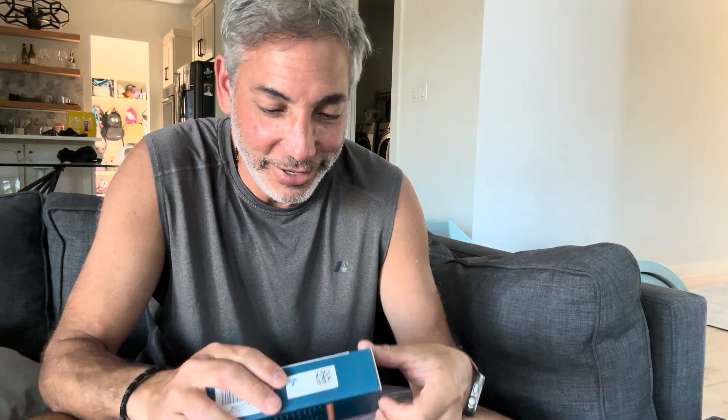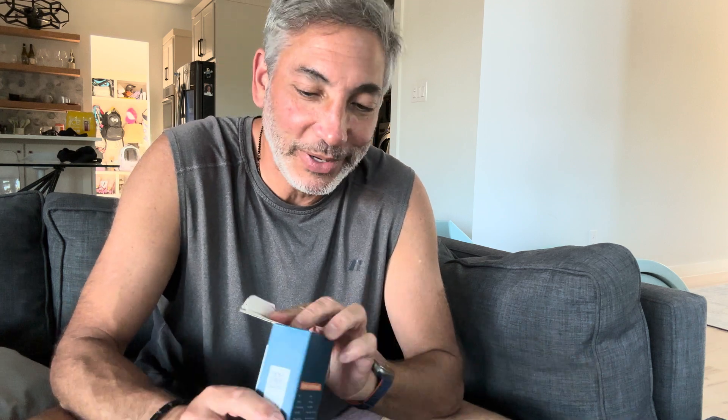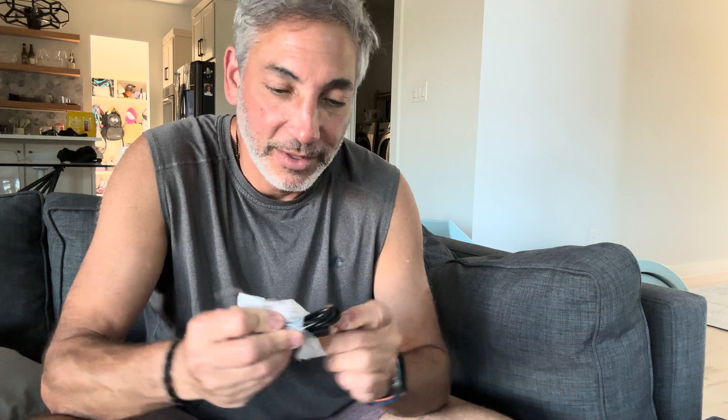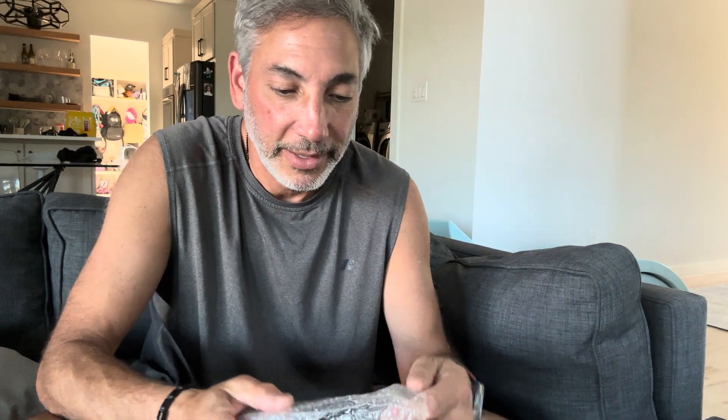Let's open it up and give it a try. I saw some people talking about one of these on TikTok and I'm like, hey I can do it too. So it comes with a little manual, a USB to USB-C charging cable, and then this is the device itself.